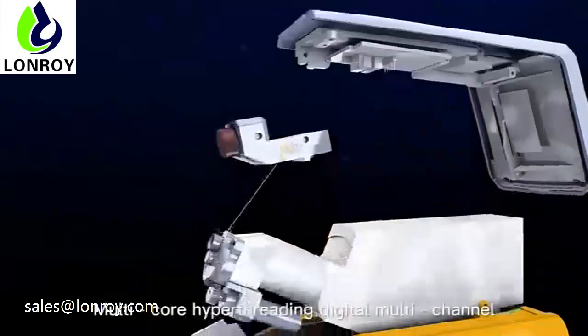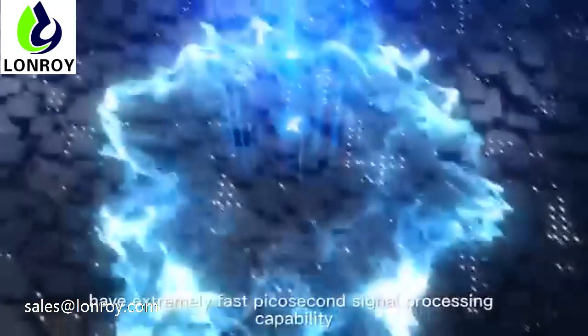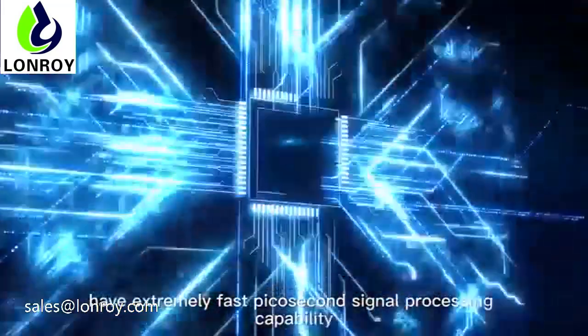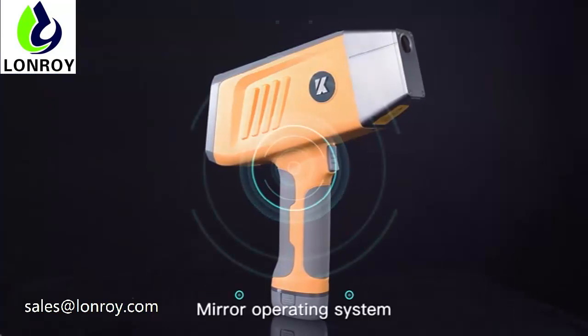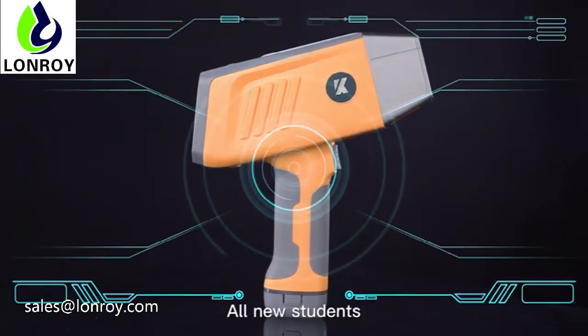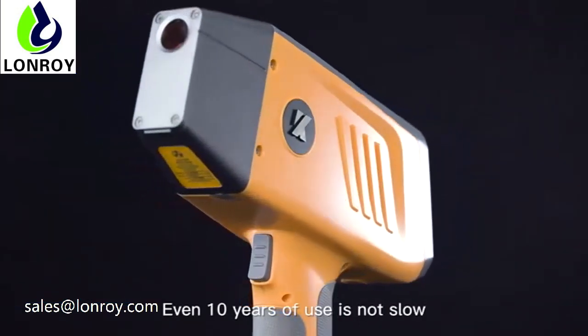Multi-core hyper-threading digital multi-channel with extremely fast picosecond signal processing capability. The analysis speed is only 0.2 seconds. Mirror operating system and instrument restart system — all new, so even after 10 years of use it is not slow.